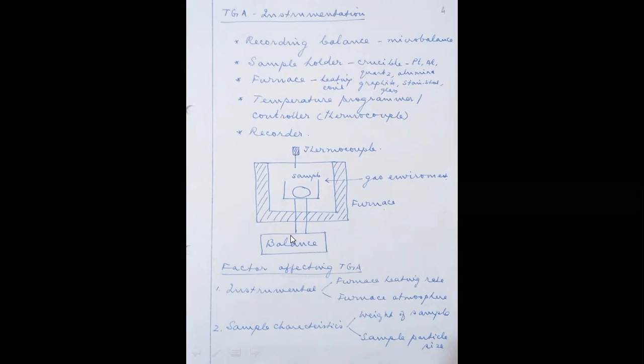So three important factors or three parameters based on which the thermogram is drawn: the variation in the weight, which is recorded by the balance, and the variation in the temperature, which is recorded by the thermocouple, and also your time clock. So with these three variables, any thermogram can be completely drawn out.